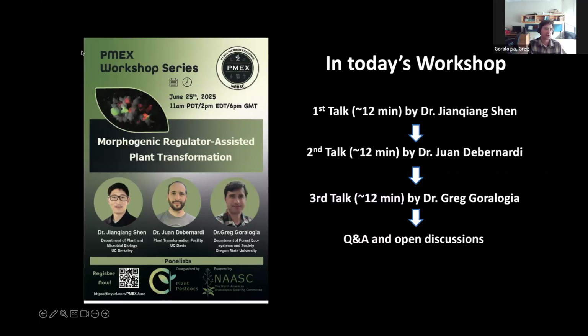And for these altruistic approaches, if you need to only select for the cells that get your trait tDNA, but you need to keep the ones that get the morphogen alive for 2 or 3 weeks in culture, then you don't want to kill them too early. And antibiotics like hygromycin that are really strong in the callus phase are going to negatively impact the morphogen-only integrated cells. And so the balance of those is actually quite critical.